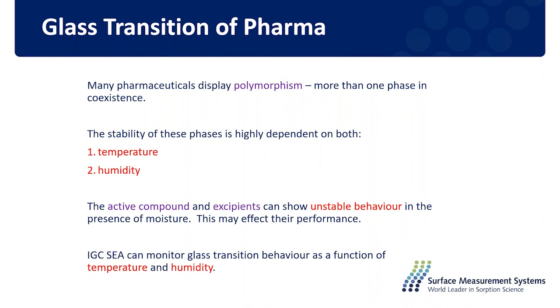So in our last study, we can analyze a stability map between our different components that we can measure in a system. So we can map how likely a sample would be to react to temperature and react to humidity, to see whether or not a sample would be stable in certain conditions.